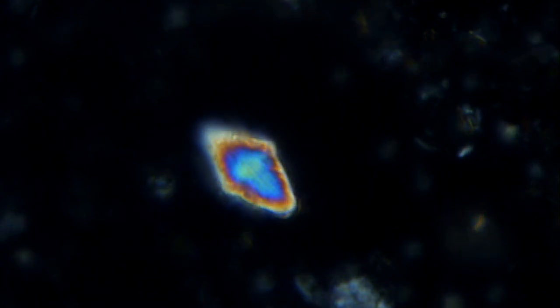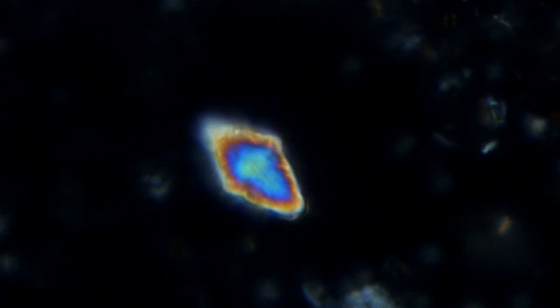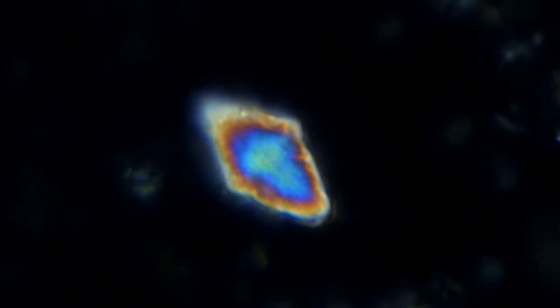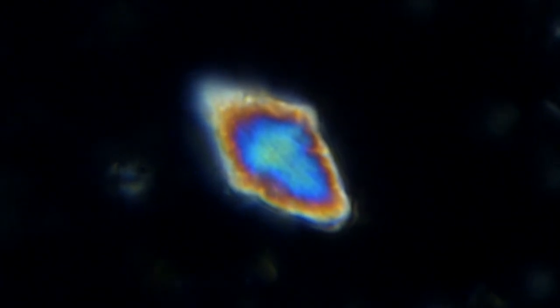Since birefringence doesn't change for this specific orientation of the crystal, this has to do with the rays traveling a longer distance inside the crystal, meaning that it's thicker in its central area. Since colors change gradually, this means that thickness varies gradually as well, giving us a perspective of the third dimension. The element is round in its equatorial plane.